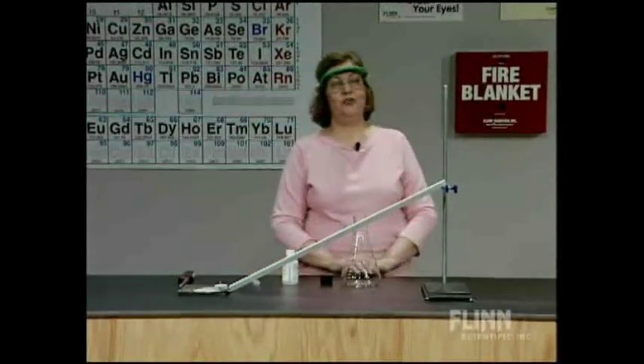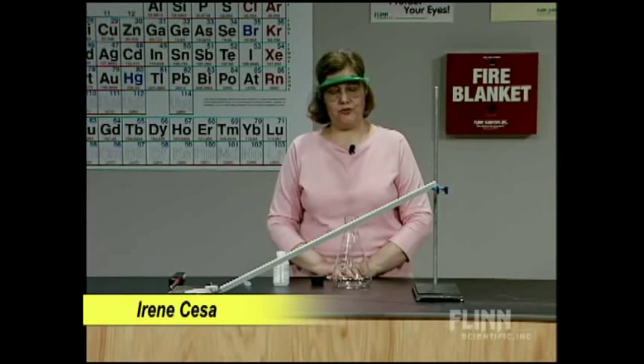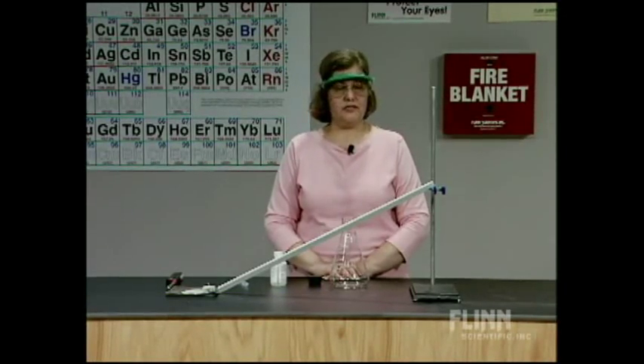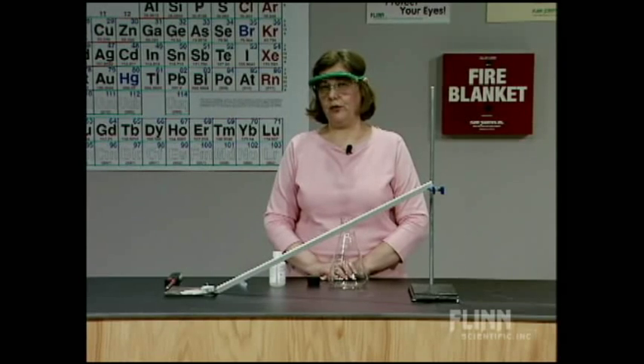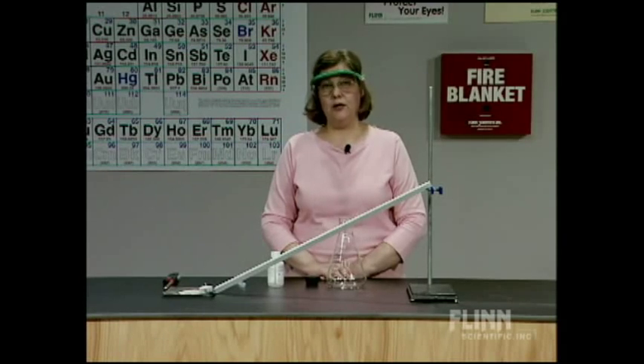I'd like to do a demonstration that we call the Flaming Vapor Ramp. We're indebted to Bob Becker of Kirkwood High School in Missouri for the design and instructions for this demonstration. It demonstrates the flammability of a hydrocarbon vapor — we're going to use hexanes — and it also talks about safety, really household safety in addition.